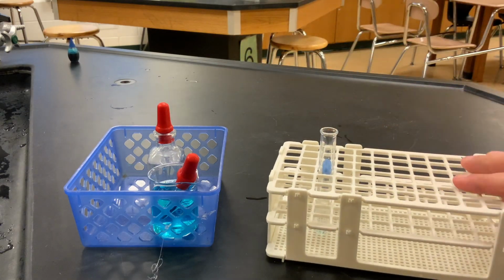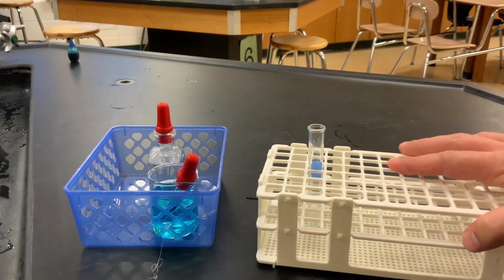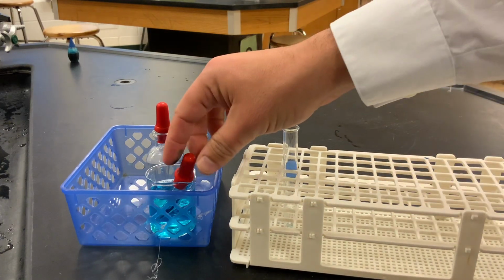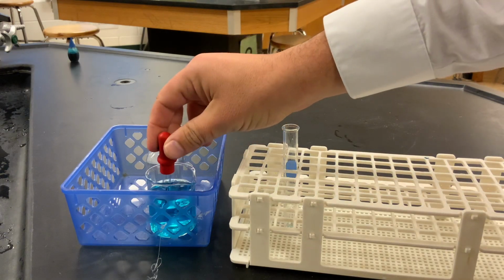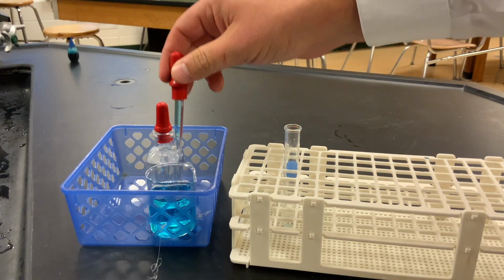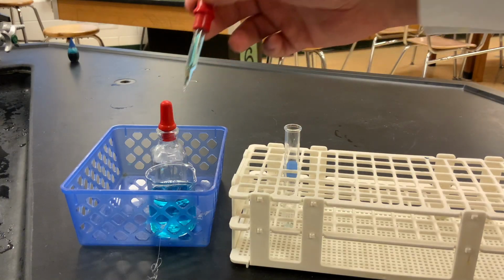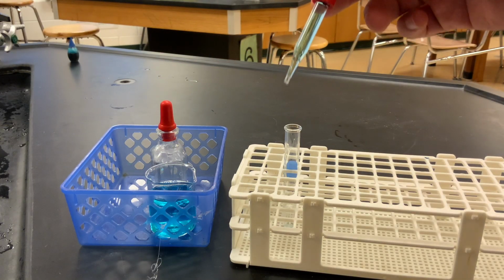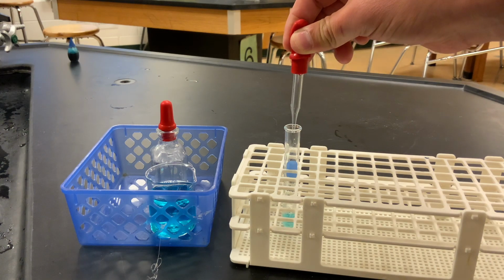So what the protocol asks for, you're going to have test tubes. You'll label them. You'll have 6 total. You would have those taped and labeled already if you look at your protocol, because you have your lab in front of you right now. But when it talks about dropperfuls, these droppers will either be in the beakers or some of them will be in these bottles depending on the substance. So I'm going to fill that up all the way. And I'm just going to drop it straight down into the test tube.